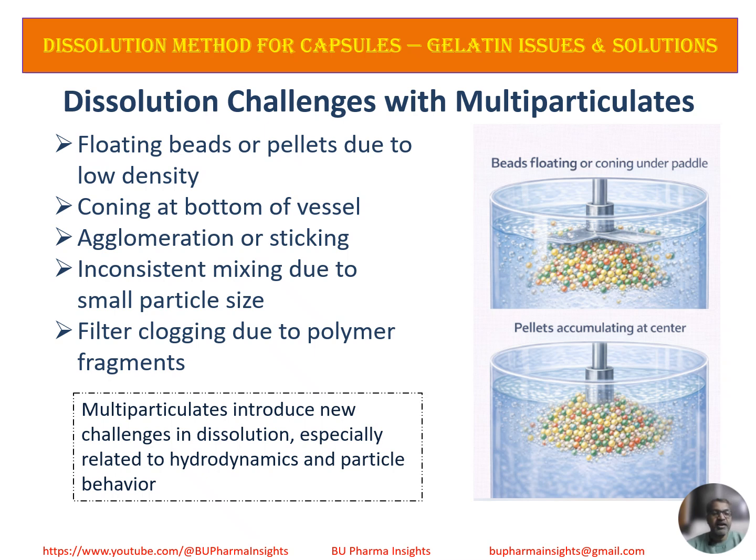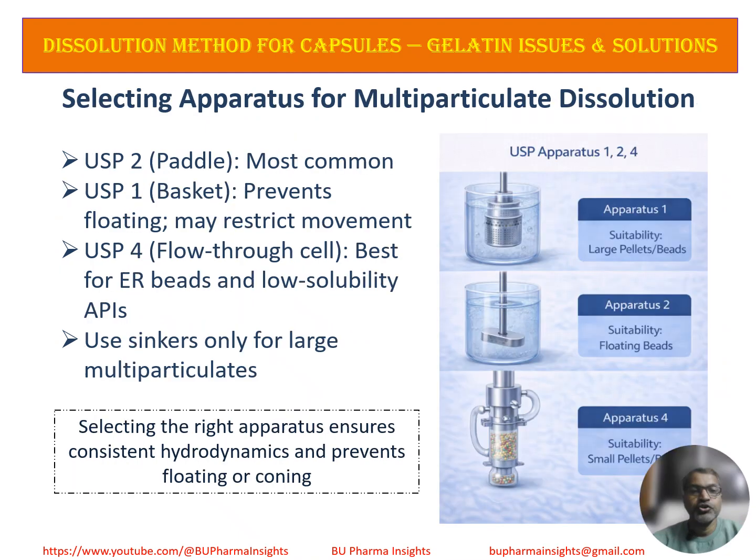All these effects can cause slow or incomplete release, high variability, or poor reproducibility. Choosing the right apparatus is critical for multi-particulate dissolution.